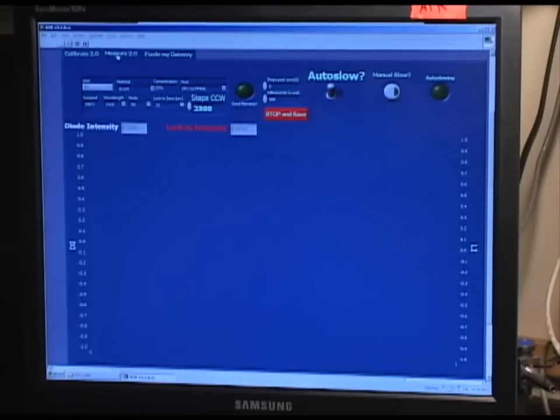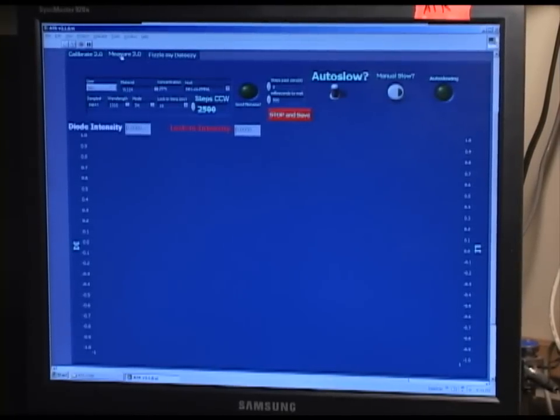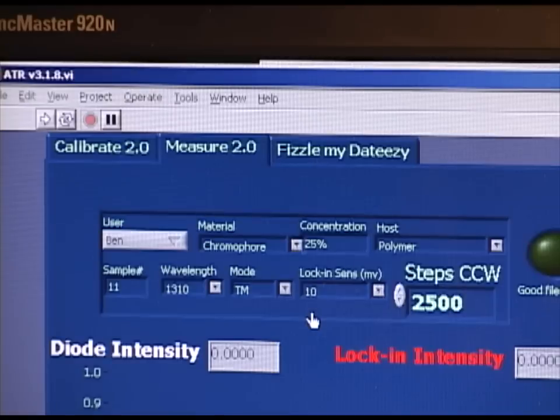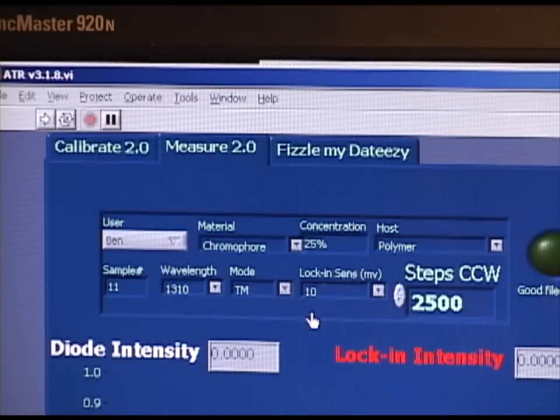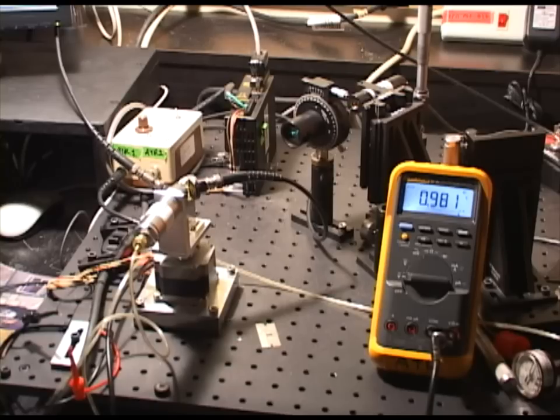Once the sample has been properly calibrated to achieve maximum signal, we want to move to the measurement frame of the program. Do this by clicking on the Measure 2.0 tab. It is now important to zero the sample or set it to its zero angle. To zero the sample, we can scan across a full range of angles to find the zero dip in reflectance or we can align the incident laser with the reflected laser out of the prism.